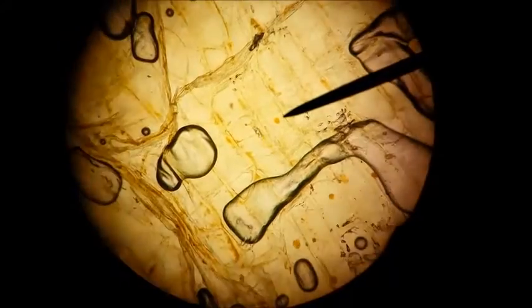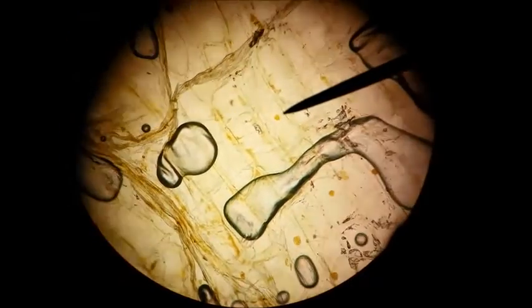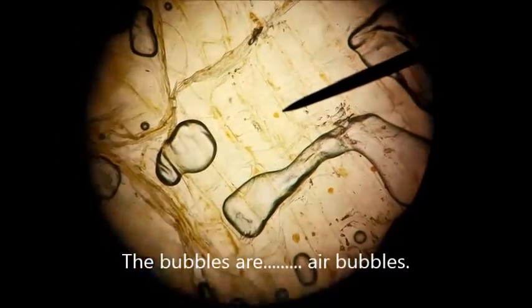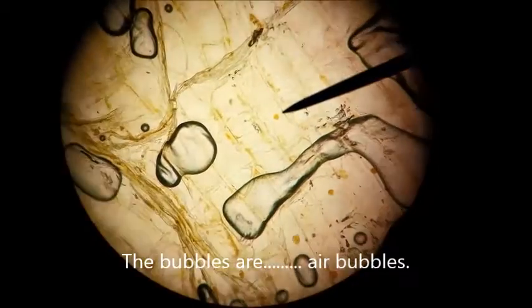This is kind of an oblique look here and I've got the pointer on a nice nucleus. And you can actually see the delineation around the cells. So this isn't bad, I would say iodine is pretty cool. Good job.